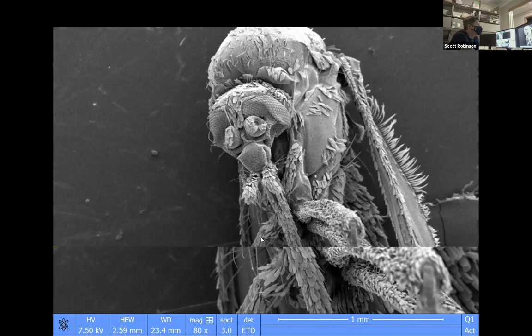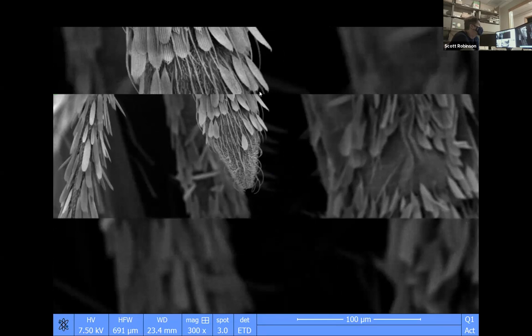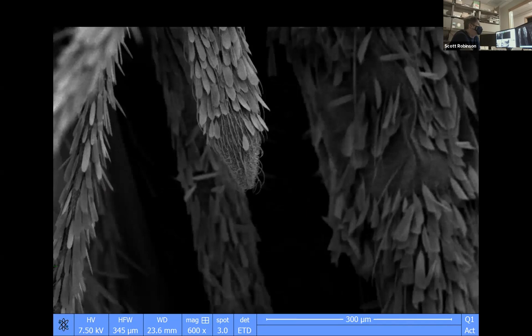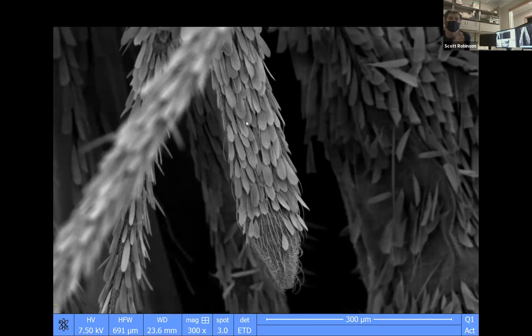Male mosquitoes don't bite, but they have a proboscis like a female mosquito. And this is what the proboscis looks like. It's kind of like an elephant's trunk, and it can move kind of like an elephant's trunk. If this were a female, we might be able to see the sharp tip of the stylets that are inside the tube that the mosquito bites with. So this is just the sheath. This thing in the middle is just the sheath, and it's going to have a slit on, I think, the opposite side.